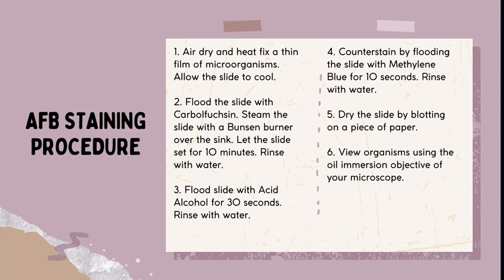Then rinse with water. And then next is to dry the slide by blotting on a piece of paper. And lastly is to view the organisms using the oil immersion objective of your microscope. Again, please take note that these procedures are subject to change depending on the protocols of a laboratory that you are assigned into.